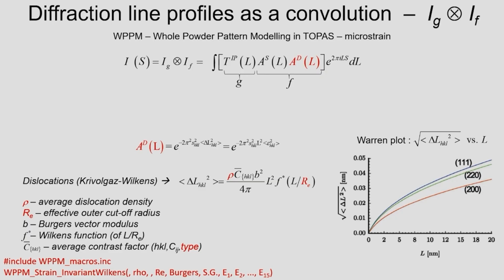You can use dislocations to measure something else. So to avoid this problem of interpretation, you can produce this plot, which is not telling you the dislocation density directly, but it's telling you what is the variance or the standard deviation, as you see here, of the displacement distribution. And this quantity is interesting. First of all, it shows the anisotropy. You see it's larger for the 111 direction than for the 200 direction, because this is an example, I don't remember which, for a material which is stiffer along 200 and softer along 111. So you can tell the anisotropy.